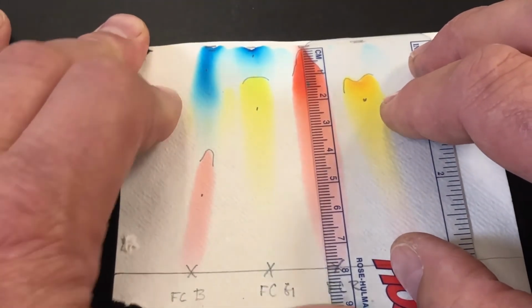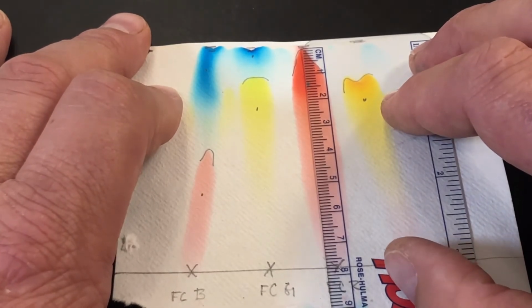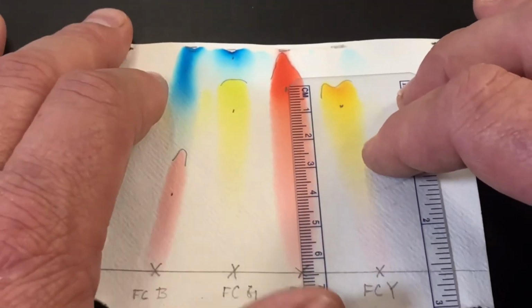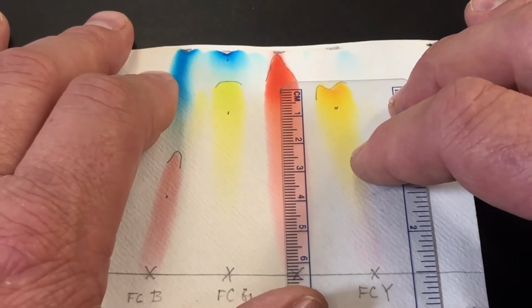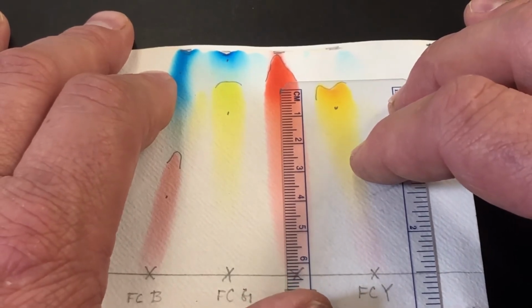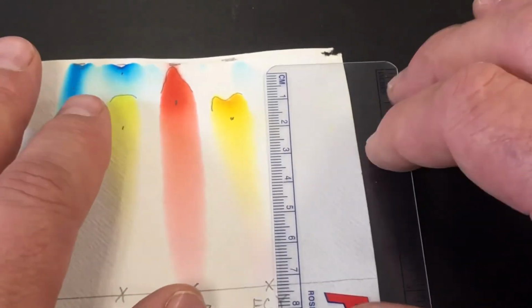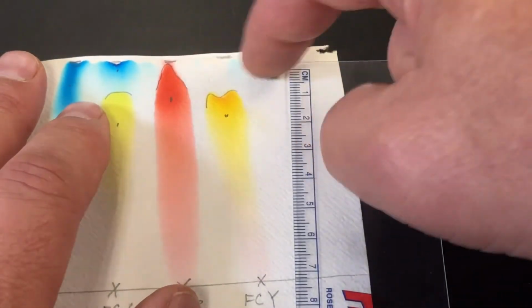Again, in this food coloring red, the total distance is going to be 7.95. The tip is going to be about 7.75. And the center mass, I keep hitting the stand here, is going to be about 6.35.